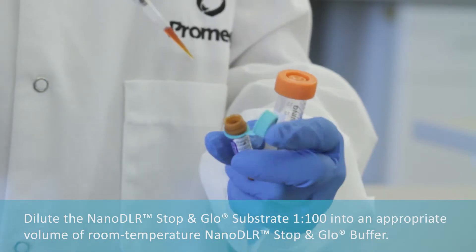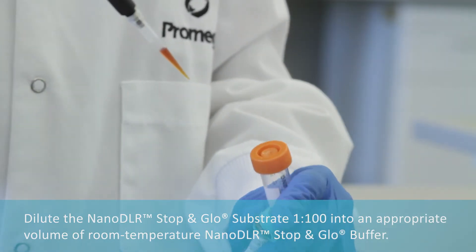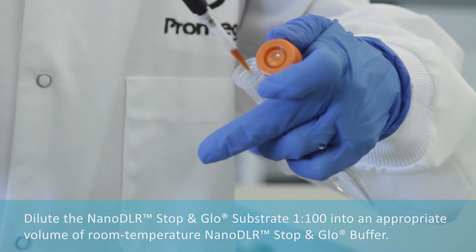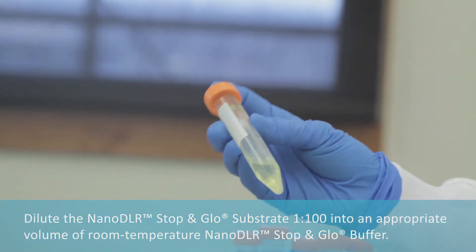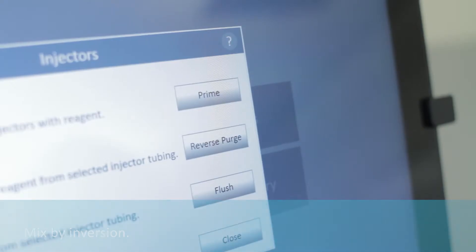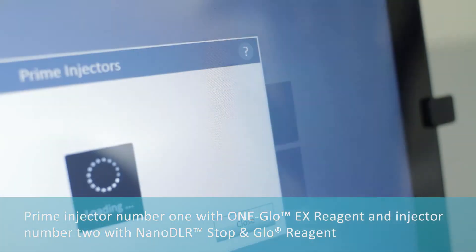Dilute the Nano DLR Stop-and-Glow substrate 1 to 100 into an appropriate volume of room temperature Nano DLR Stop-and-Glow buffer. Mix by inversion.